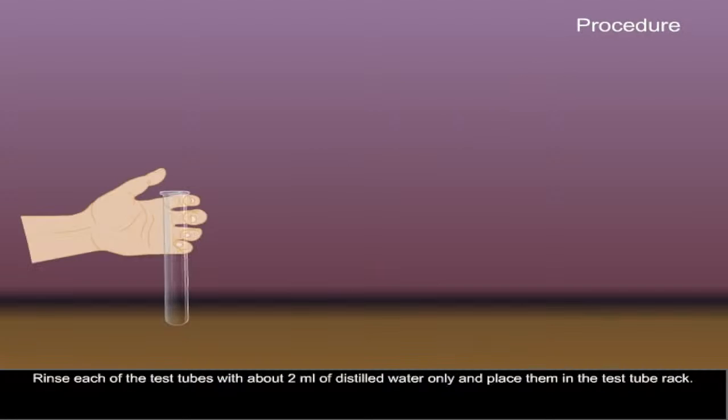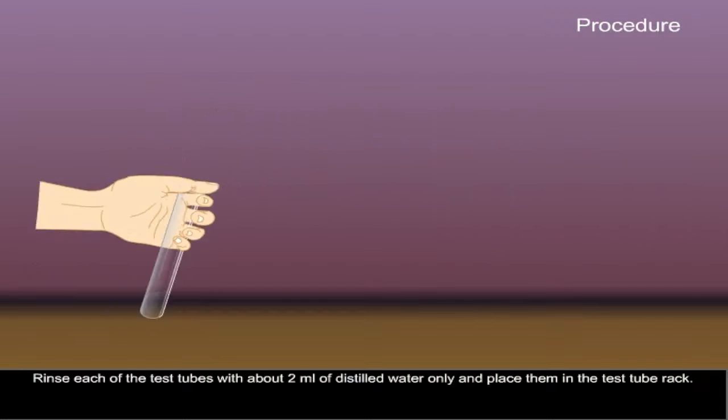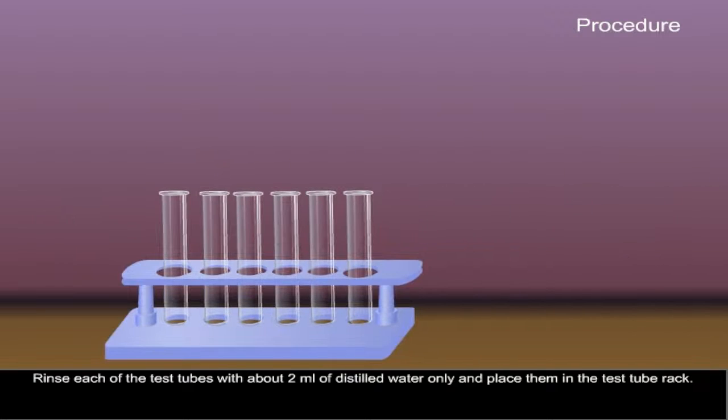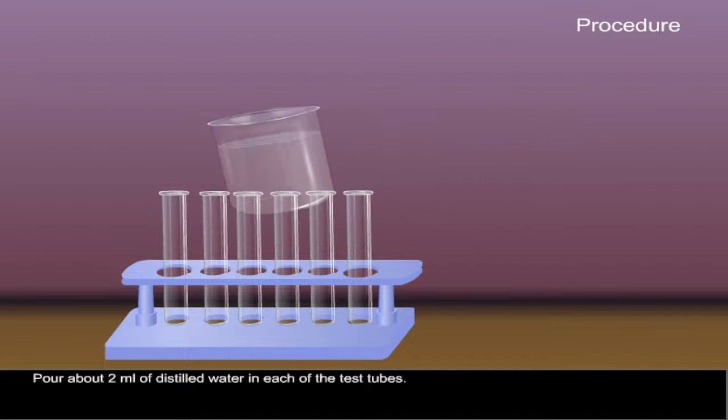Procedure. Rinse each of the test tubes with about 2 milliliters of distilled water only and place them in the test tube rack. Pour about 2 milliliters of distilled water in each of the test tubes.